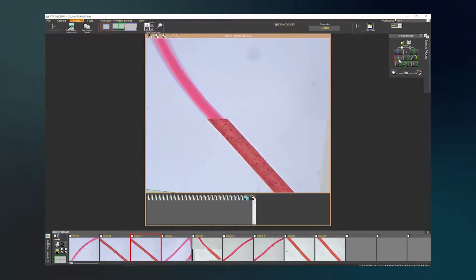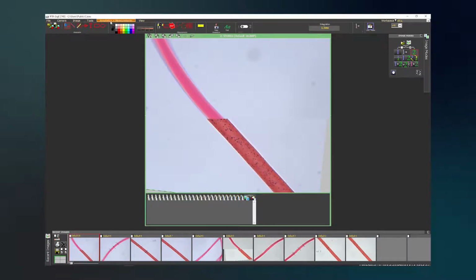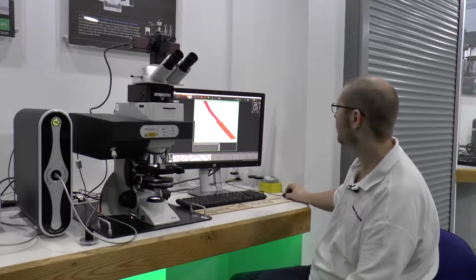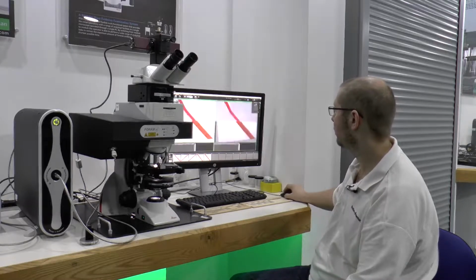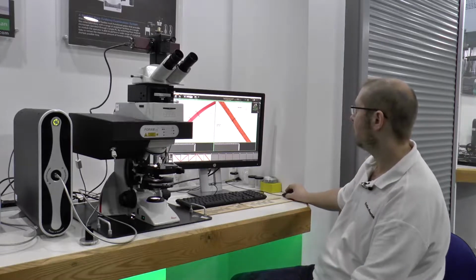And with a split image, we can of course capture that in here. We could then just go back to the single image, and again we can then drag and drop back into here as our stored image, and again we can go back to the annotations and measurements if we need to. So here we can point out various features, like so. If I go back to the side by side, again I can very quickly drag and drop the images that I recorded earlier.